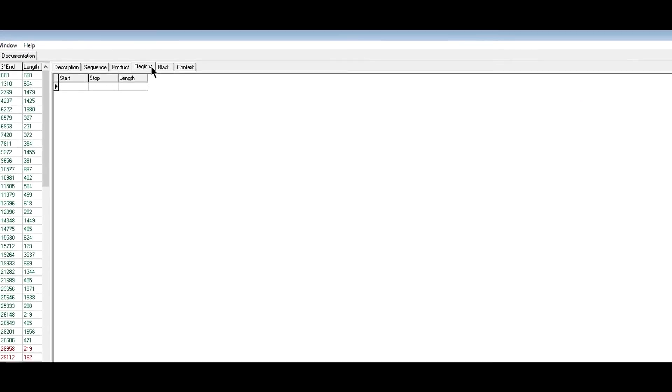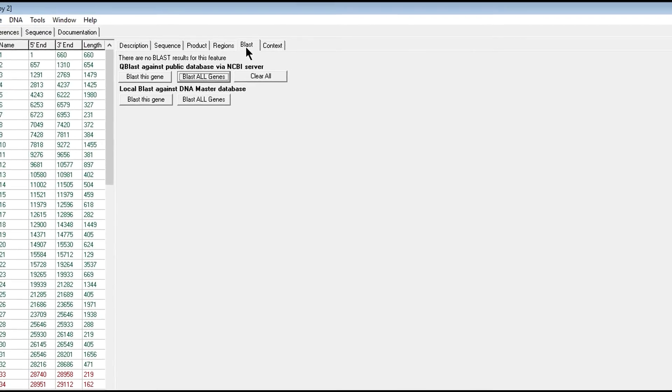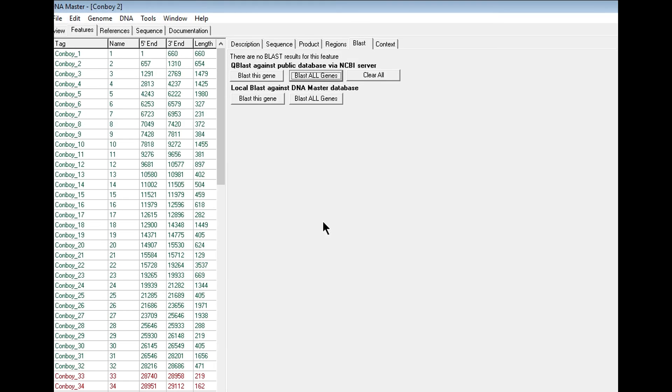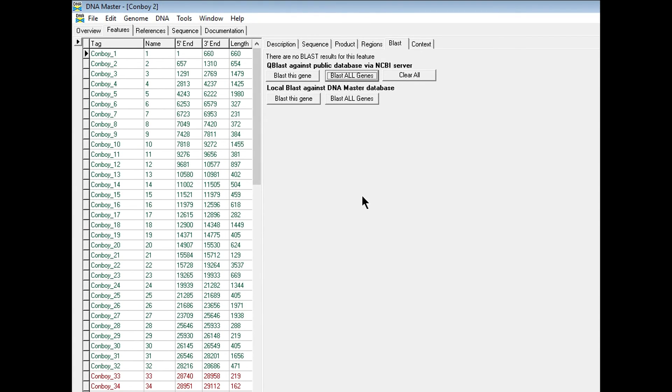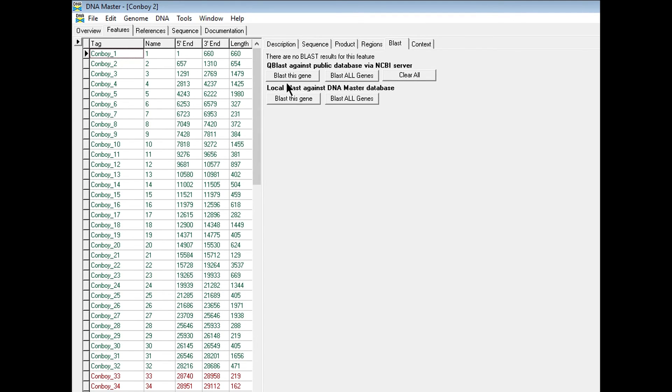We will skip the region section for now. We'll go to the blast section. This is where you can view your blast results that you did if you ran blast with the auto annotation process. If you did not run blasts like I didn't in the past tutorial, all of your genes will be empty for this section. This will show no blast results. However, if you did take the extra time to blast it, you should have a list of blast results here, and that will tell you different values of different things, and we'll get into that at a later date.